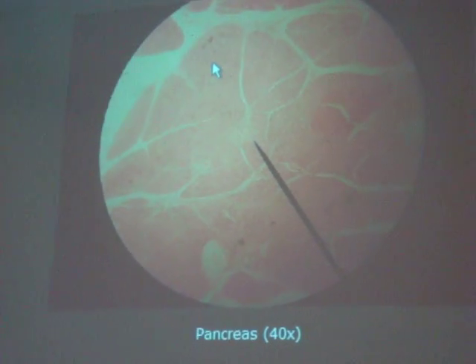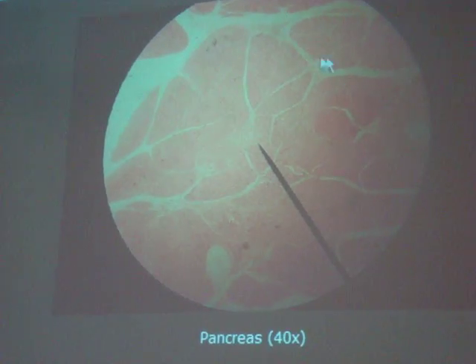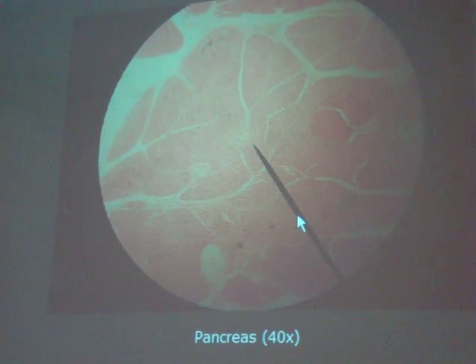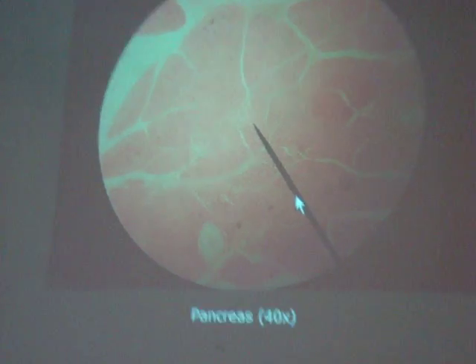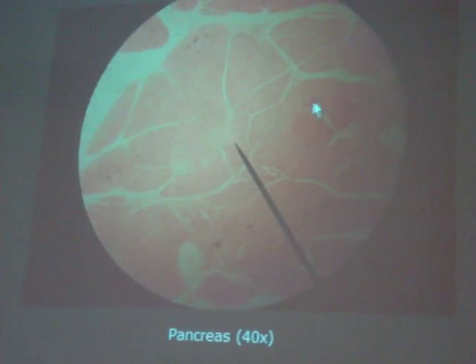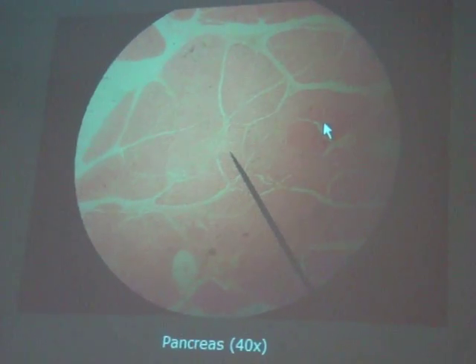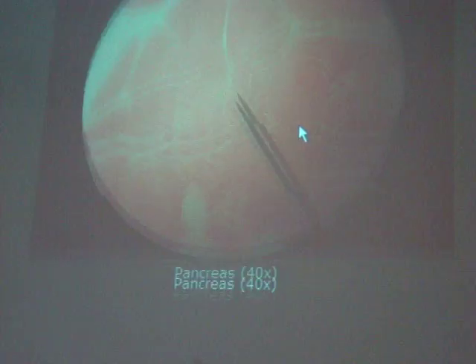Microanatomy pieces, the first thing you want to do is skip over the pancreas. Because the pancreas is kind of hard to see, the islet of Langerhans. So do that last, because Daniel and I probably have to come show you. But on this slide, this kind of looks like an islet of Langerhans. It's a discolored section. That's what it's going to look like. You're going to see light pink and then suddenly a dark pink, or it could be darker on your slides.